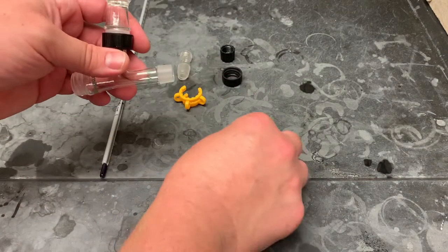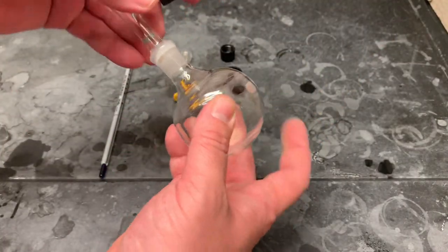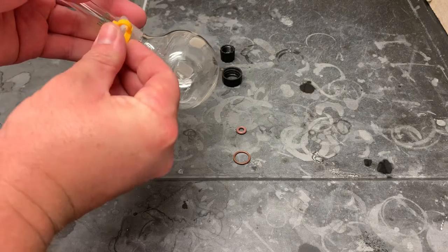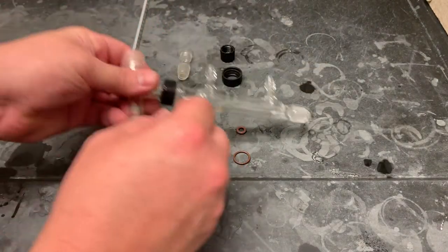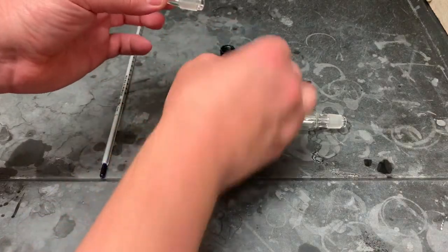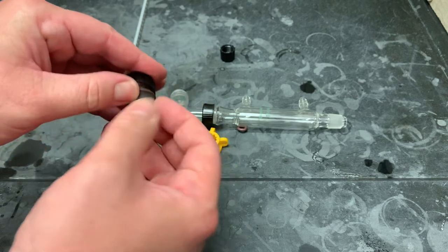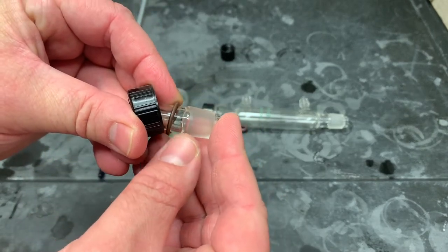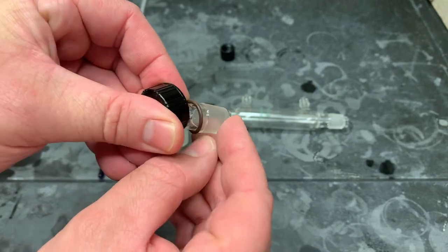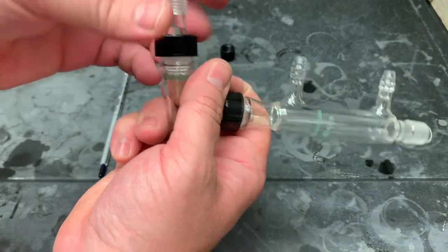And just as before, this bottom one, we're not going to need it because our round bottom can't actually have that, so we're just going to have a K-clamp right there. But it's not required if you clamp the bottommost piece. So we don't need one right there, but we will need one up here, so get this one on. And as always, we want to get that O-ring past this glass lip right here, and we can connect that there.